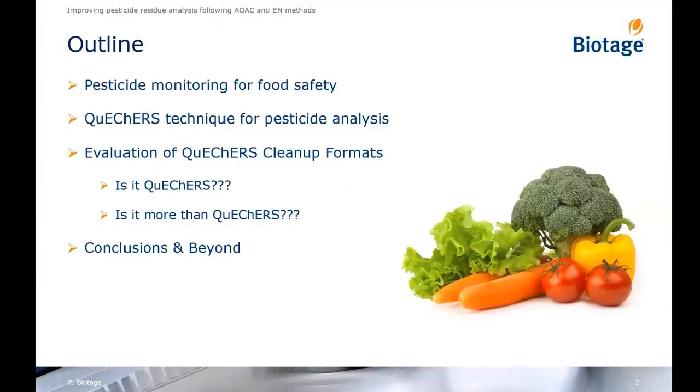So going over the outline for today's webinar, we're going to briefly overview pesticide monitoring in the food safety industry and what that entails. Then we'll step into the actual QuEChERS technique, which is a very common technique for pesticide analysis in the industry. And then from there, we'll jump right into our evaluation of two cleanup formats.